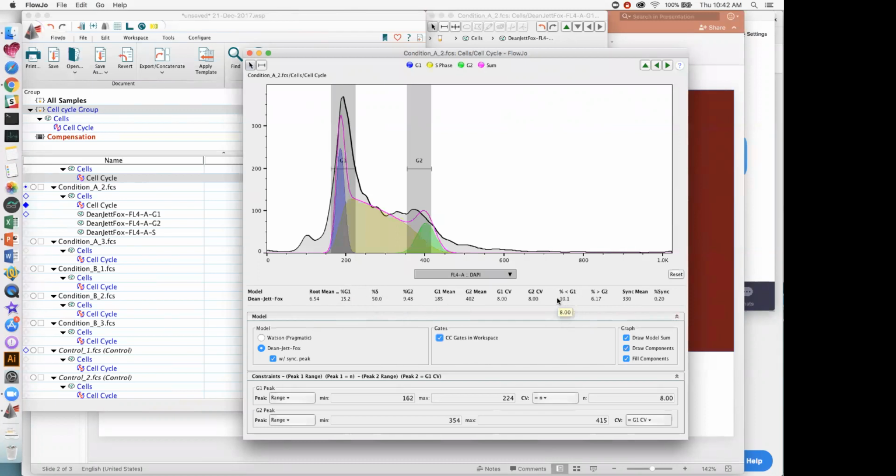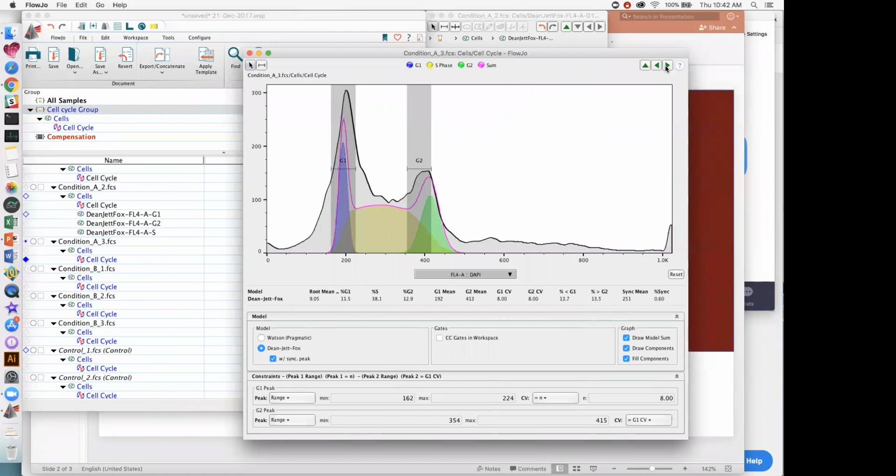So that the model doesn't equal 100% is not critical. It's not a problem. It's just a matter of the constraints that have been applied to the model. In some instances, you'll see that it gets closer to 100%. Other times, you'll see that it falls well short of 100%, and not to be alarmed, that's just how the algorithm works, and there's nothing we can do to increase or decrease that without changing the model in its entirety.